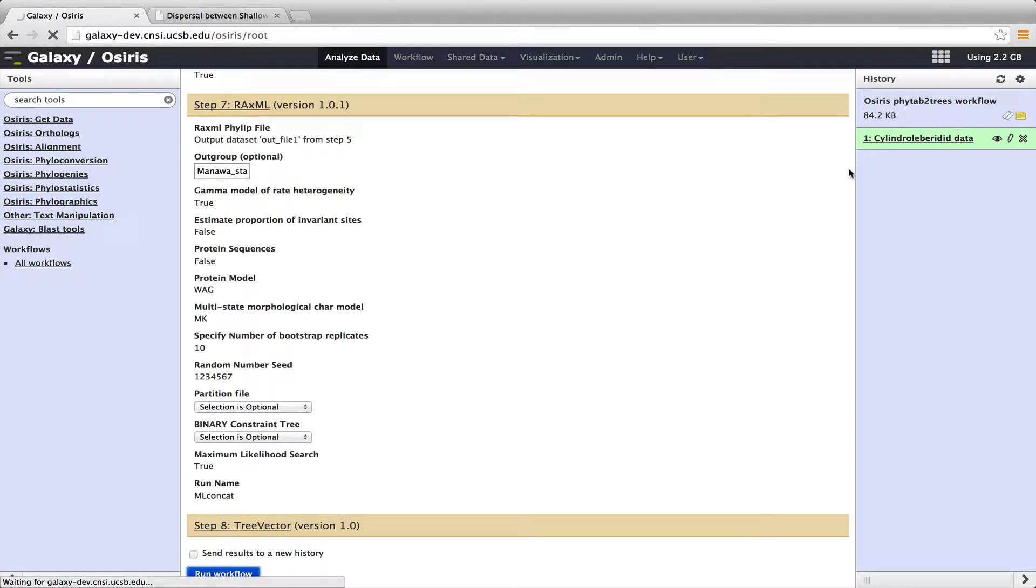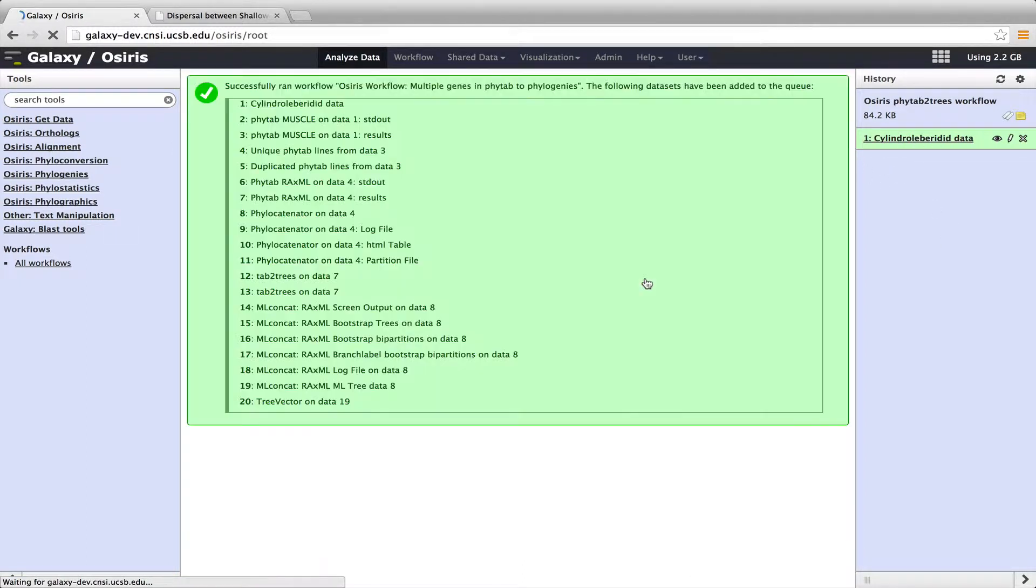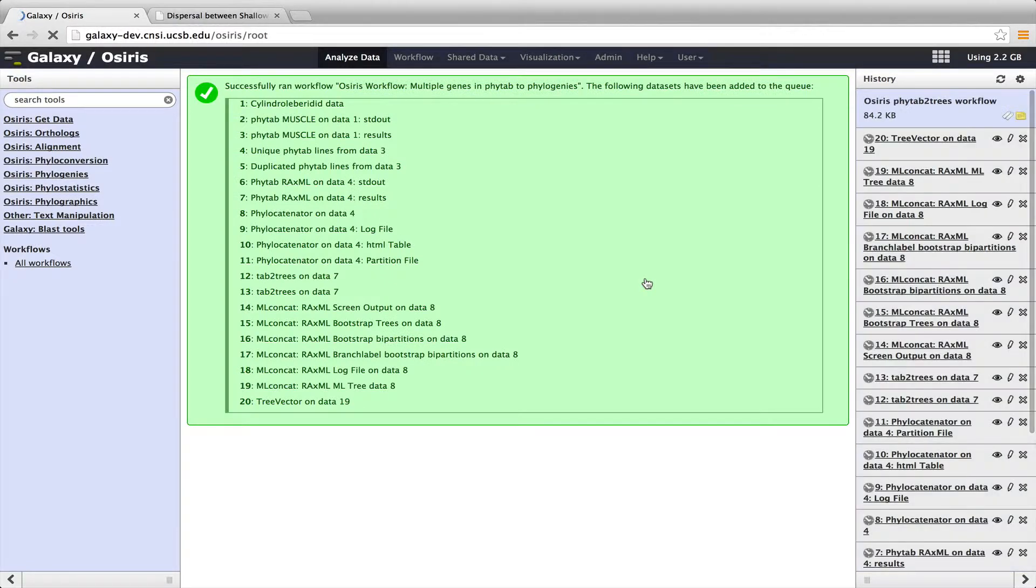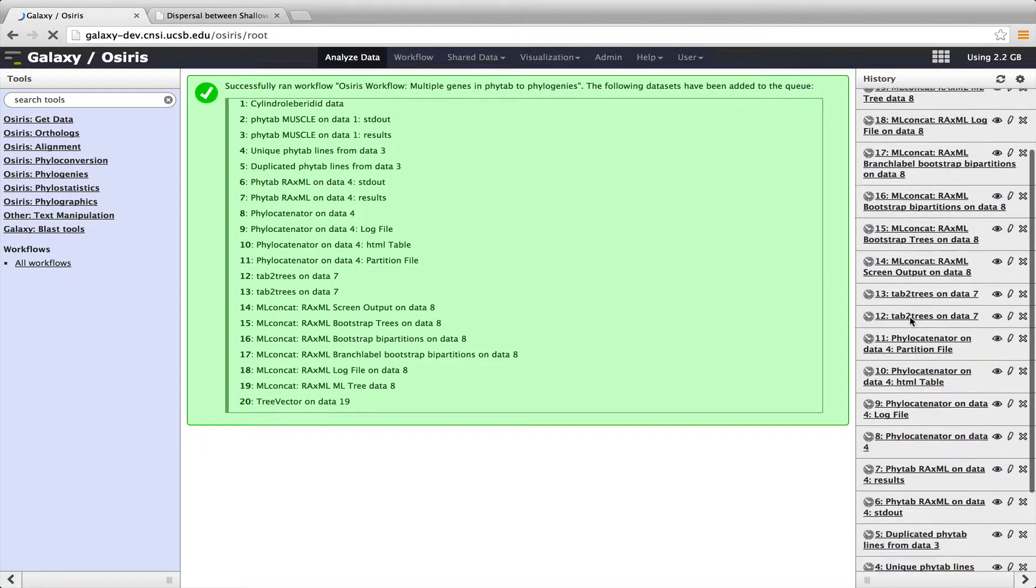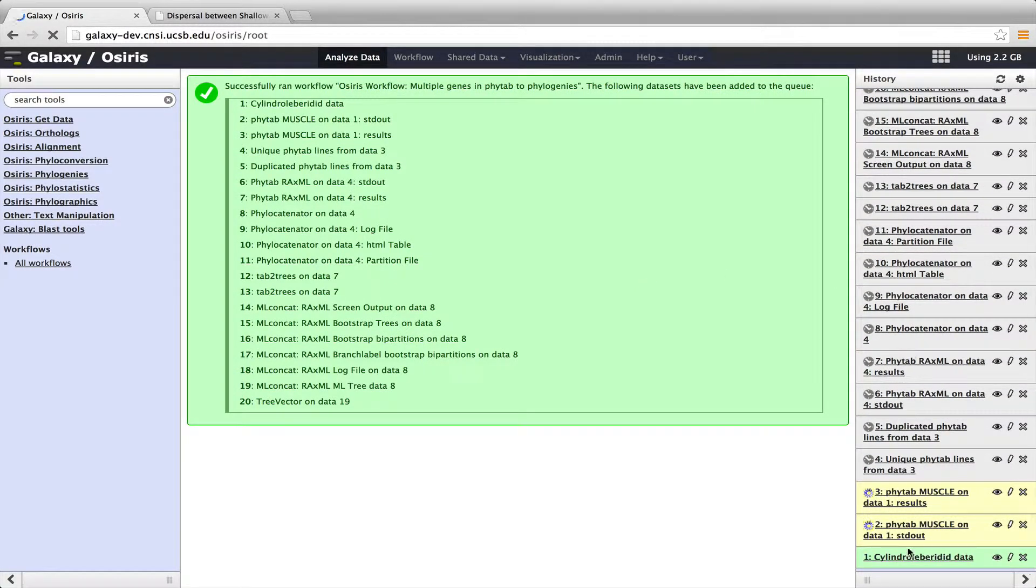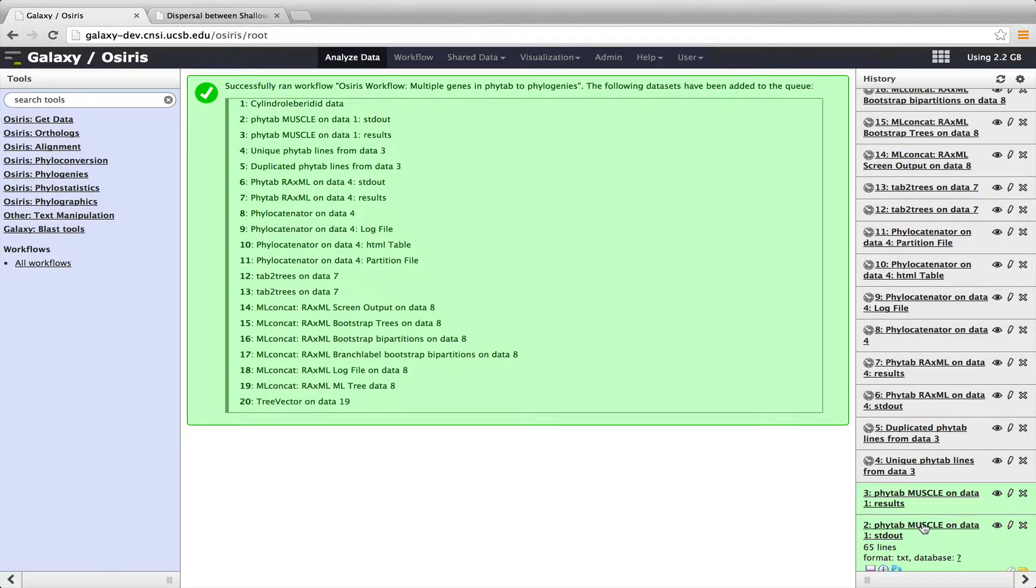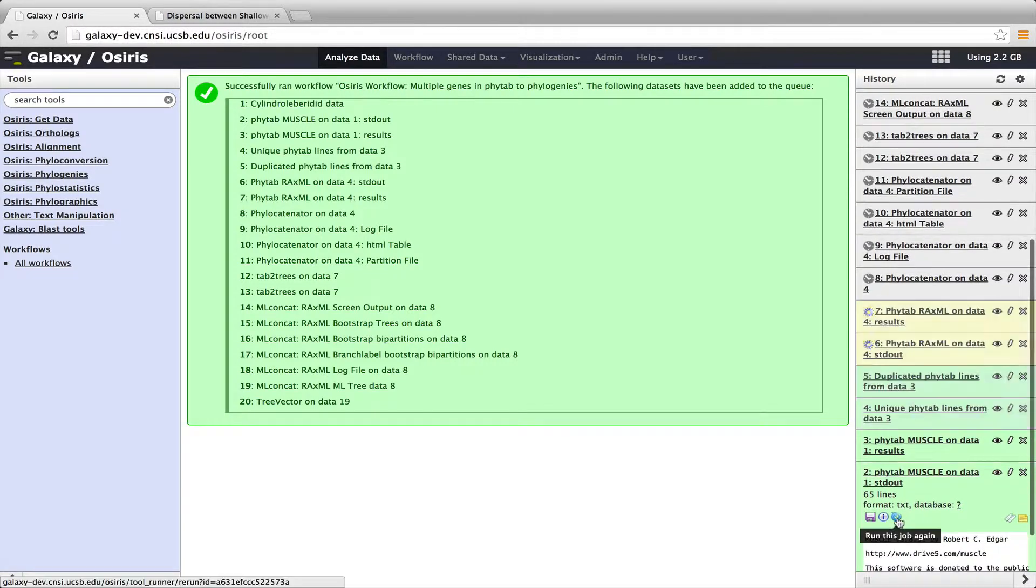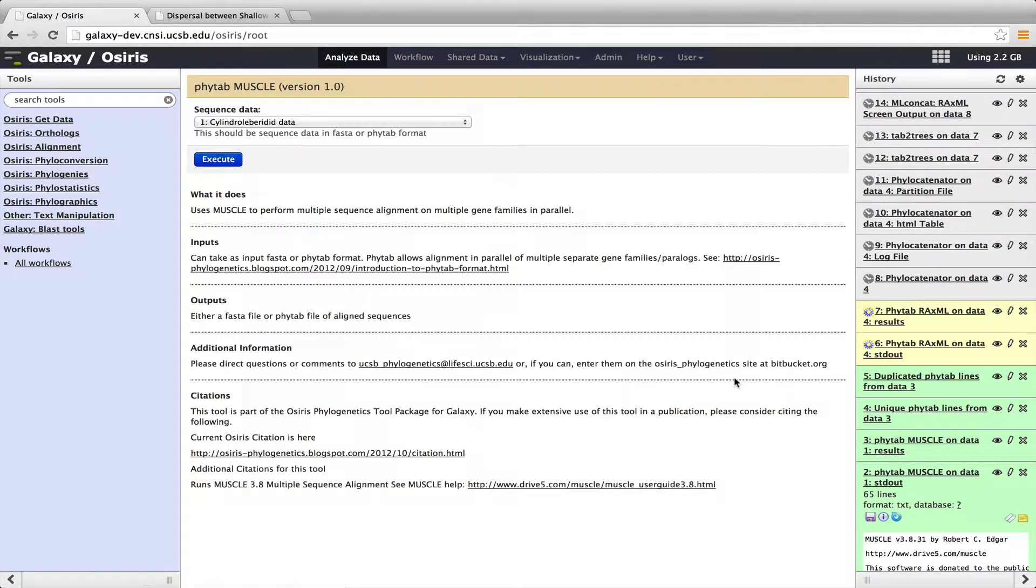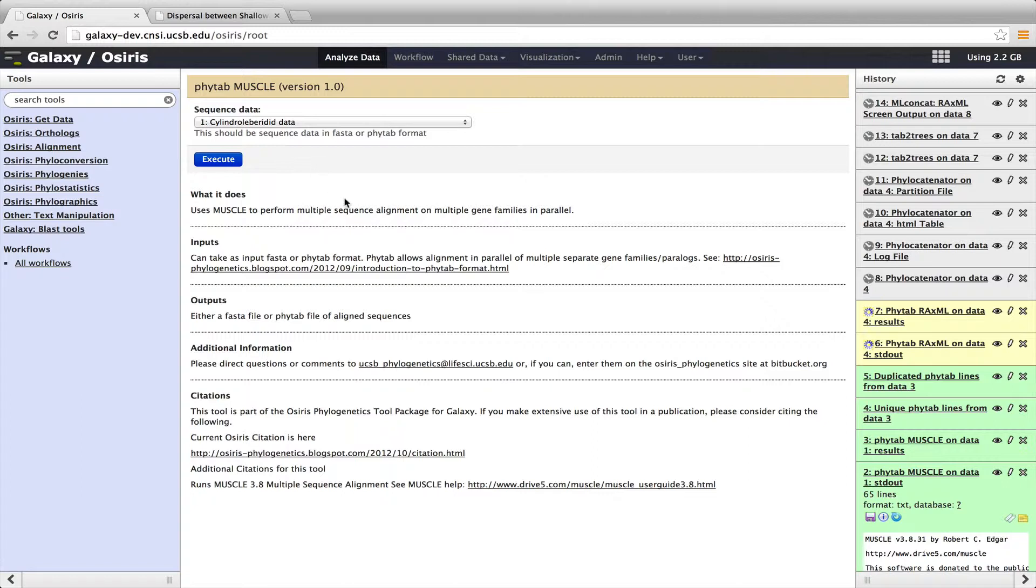So what this will do is take that data set and run it through the workflow that I just showed you. You can see here that when it turns yellow, it means that tool is running. So right now we're aligning within MUSCLE all four different genes. And I can show you, clicking on this tool and then clicking this circle arrow, that would allow me to rerun this data. Here's the MUSCLE tool, what it looks like. It takes in the sequence data and outputs the aligned sequence data.